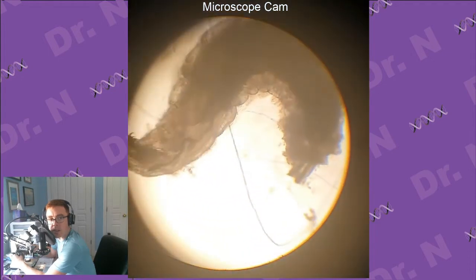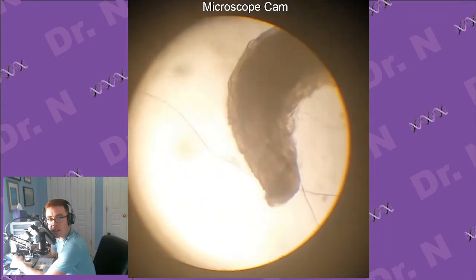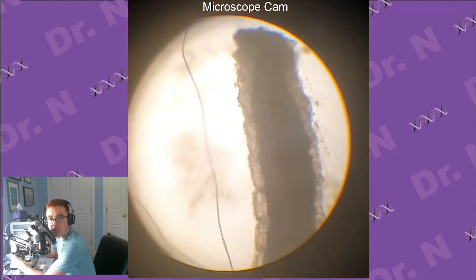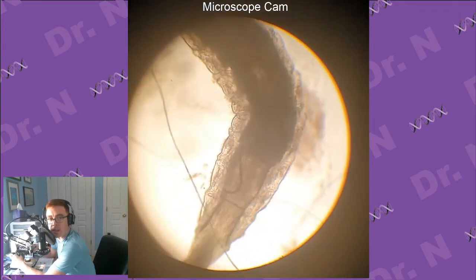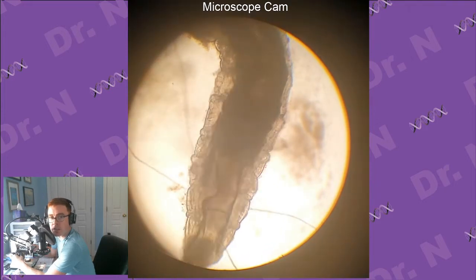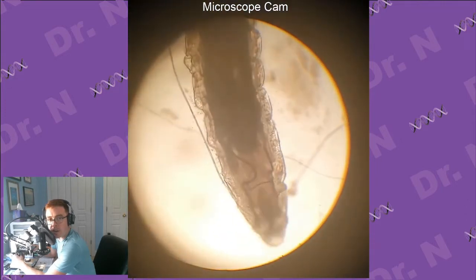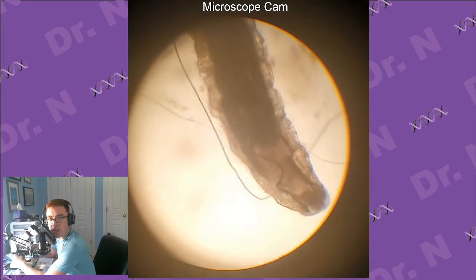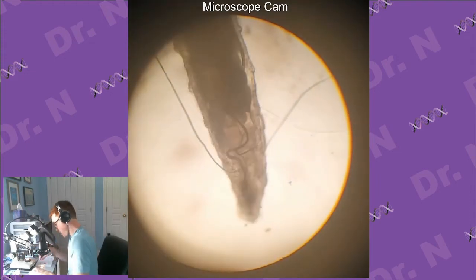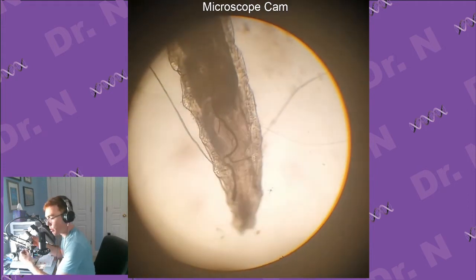Yeah, so it's just trying to go around, find some food. It's got some more tracheal tubes up front. That's how it exchanges gases into its body. This darker part is most of that fat and also the digestive system inside this guy. So he's not going to like it, but I am going to rip him in half. I'll move the half we don't want, which is the posterior end, out of the way, and I'll leave just this front part. He'll still try to keep on finding food with his mouth hooks that he's extending right there. You can sort of see them. There's also some strings that I accidentally picked up, so I'm going to try and move those out of the way too.